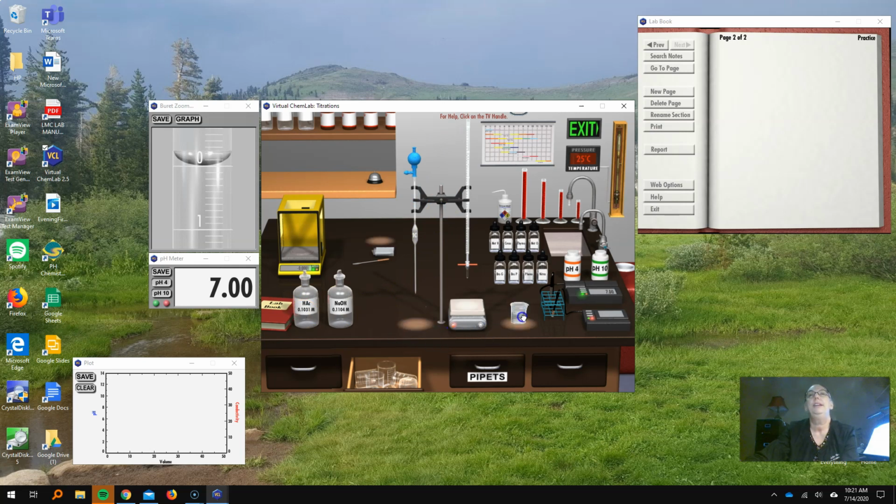I'm going to put that over here. I don't need it anymore. I'm going to get a fresh beaker. I'm going to empty the pipette. I'm going to put it here underneath the burette. It's got a stir bar in there. The magnetic stirrer is stirring. It makes it really good to see the exact endpoint. So we always want to have a stirrer here and a stir bar. If you don't have those, you're going to manually swirl the beaker or the flask that you have under here.